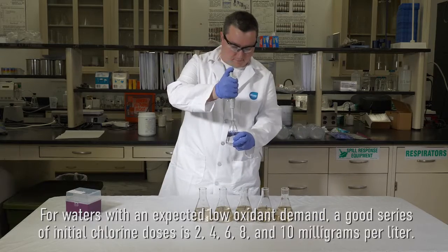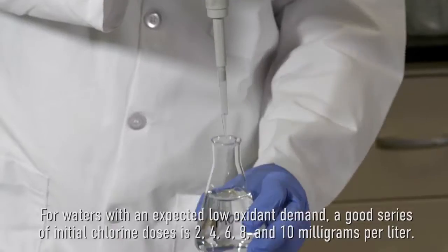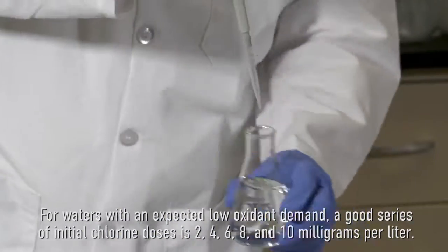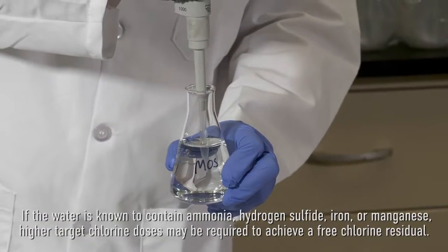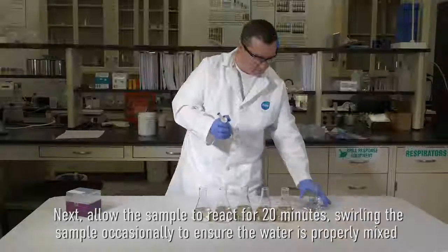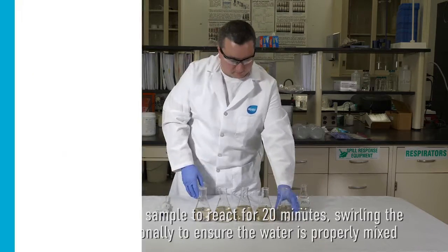For waters with an expected low oxidant demand, a good series of initial chlorine doses is 2, 4, 6, 8, and 10 milligrams per liter. If the water is known to contain ammonia, hydrogen sulfide, iron, or manganese, higher target chlorine doses may be required to achieve a free chlorine residual. Next, allow the sample to react for 20 minutes, swirling the sample occasionally to ensure that the water is properly mixed.